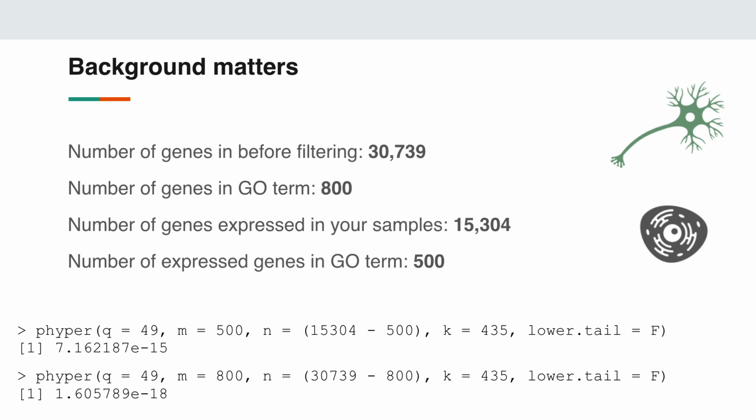Using the incorrect background will also lead to other spurious events.